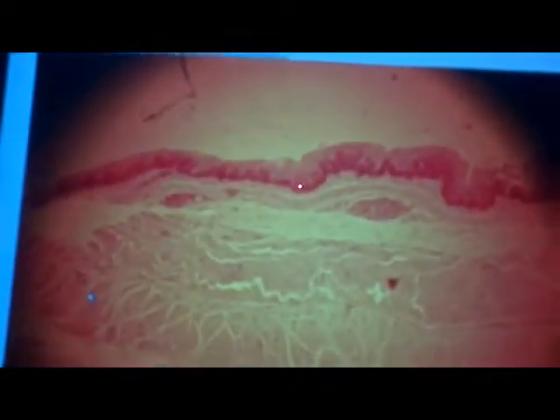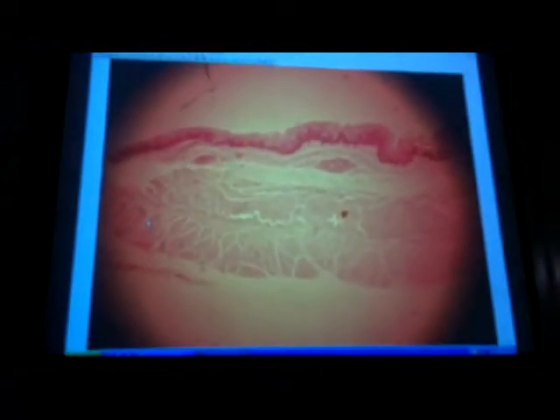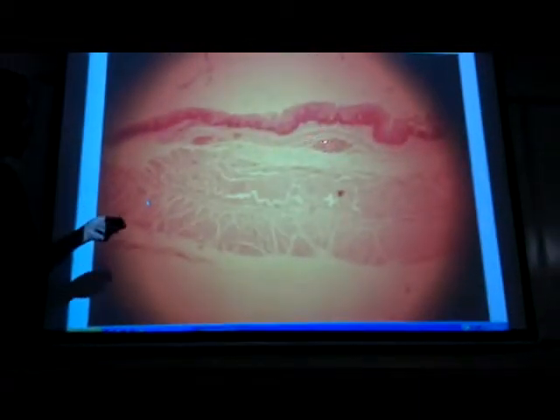Slice. Okay, look at that. So what is that? The muscularis mucosa, what is that? Lamina propria. I mean, think about what this is doing. Big bolus of food. You're trying to push it down your food tube, down to your stomach. You have a big muscularis mucosa. What is that? These are glands in which layer?